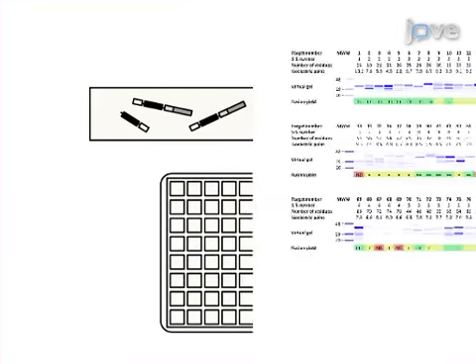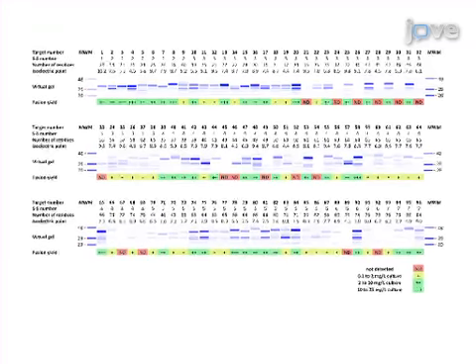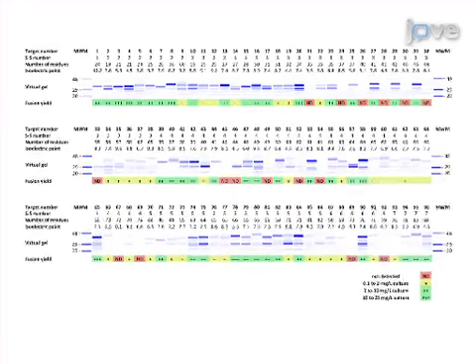Ultimately, the solubility levels for each intact target fusion can be measured to determine the optimal expression conditions for protein production and the generation of successful targets. The main advantages of this technique over traditional methods are the increased efficiency, the limited batch-to-batch variation, and the simplicity of the data handling and tracking.